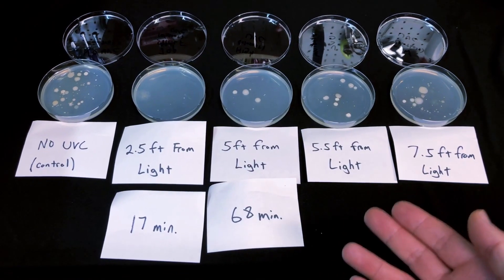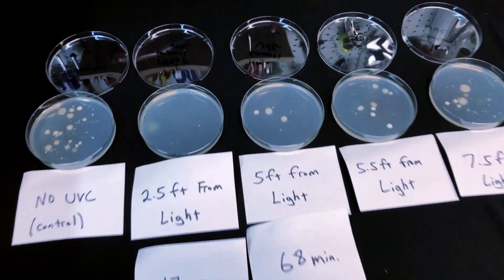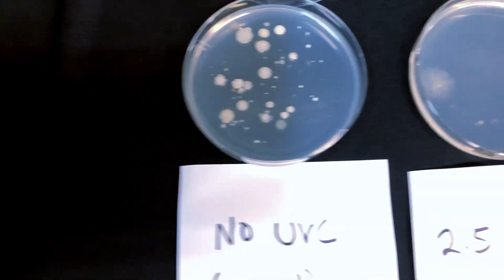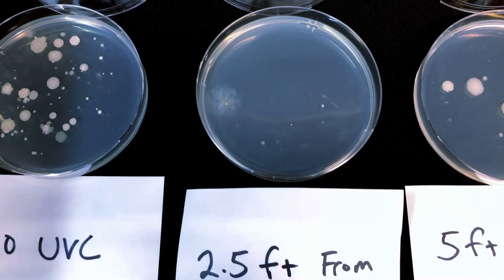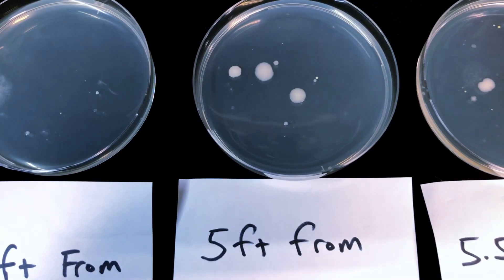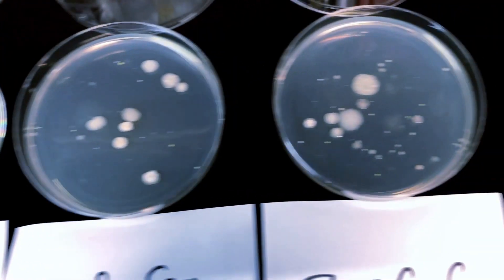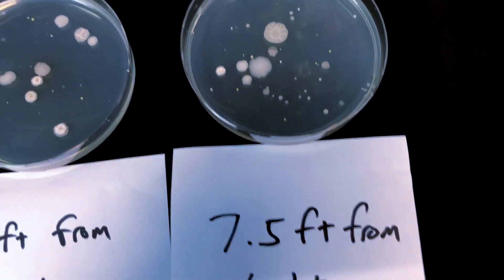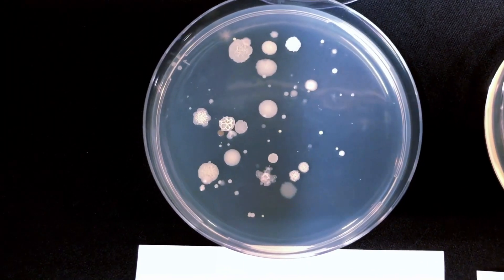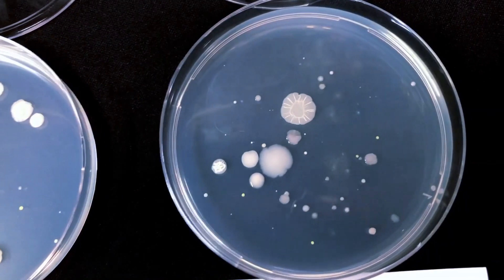These dishes have spent a few days in the incubator. On the far left is the control — touched with fingers, no UVC exposure. Next is the dish closest to the light at 2.5 feet. Then the one at five feet, then 5.5 feet on a stool, and finally the one on the floor at 7.5 feet. Take a close look at that last one — compared to the control, they look very, very similar, almost like there was no effect.